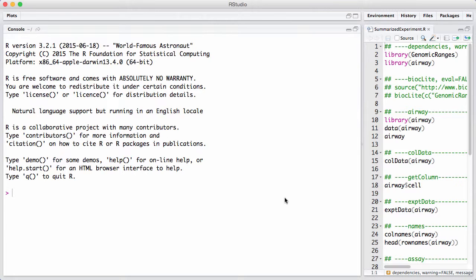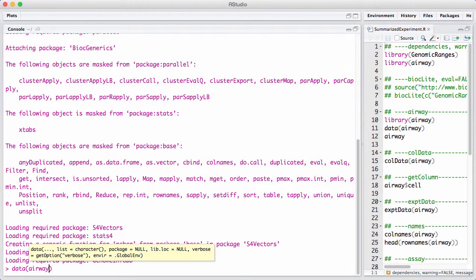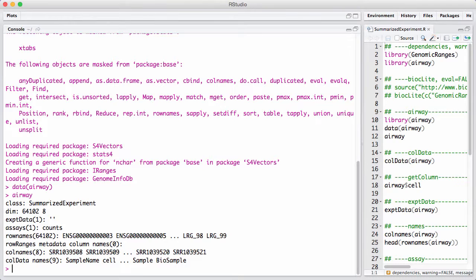We will use an example data package called airway to illustrate it. We need to load the data into R and we can print it. This looks superficially somewhat similar to an ExpressionSet — it has dimensions of 65,000 rows and 8 columns, meaning 8 samples and 65,000 genes or exons.